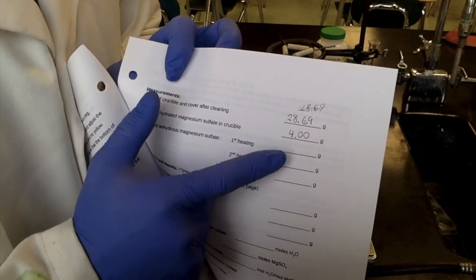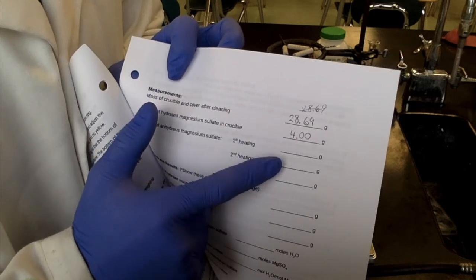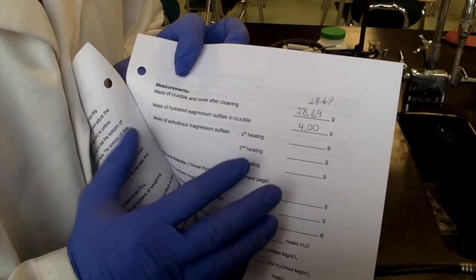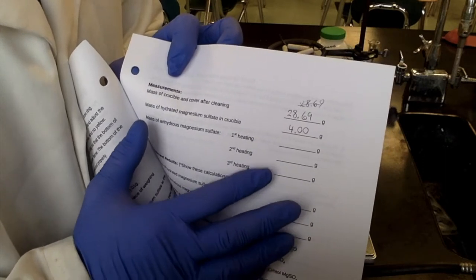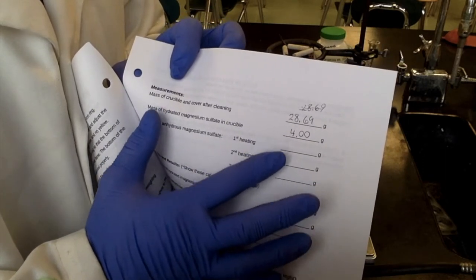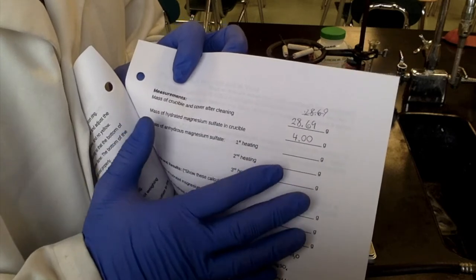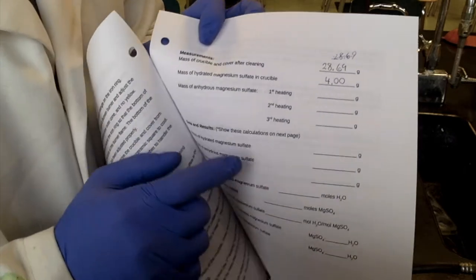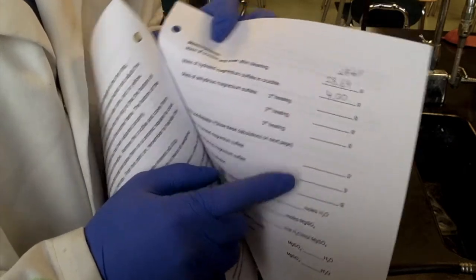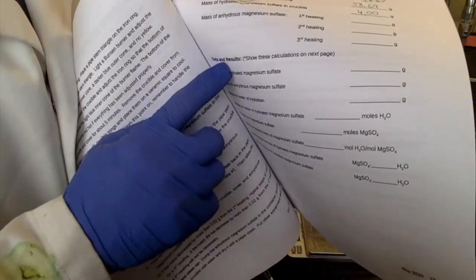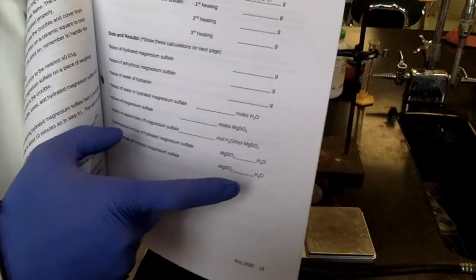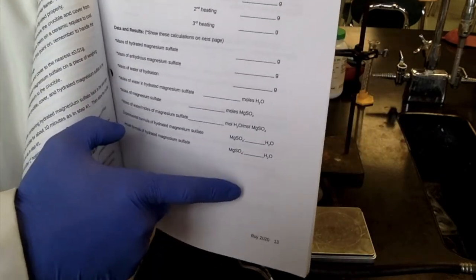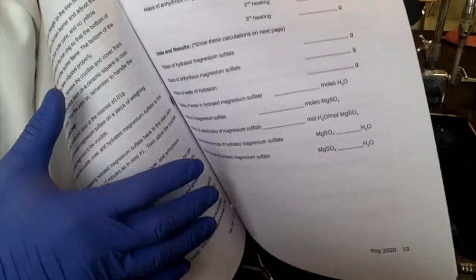And then we'll just have to see if we need a third heating or not. Because if the first and second heatings are relatively similar in mass, then you can forgo the third heating. You've already lost all your mass in the first two things, so you shouldn't have to do a third one. And then from that information, you'll be able to calculate all the data and results for the experiment and see what the final formula is for the hydrated magnesium sulfate.